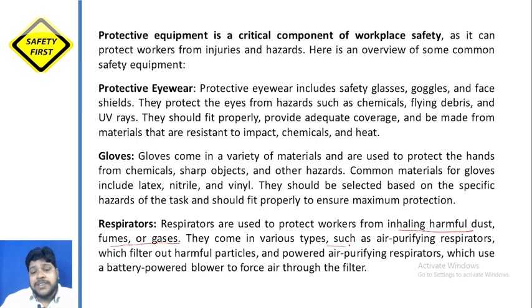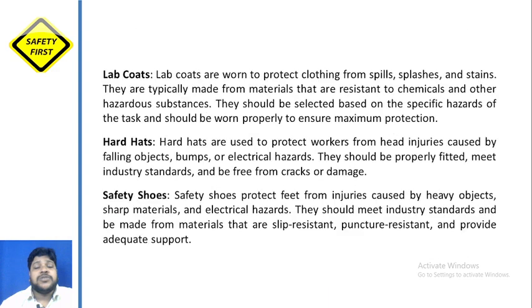कई सारे रेस्पिरेटर्स होते हैं. Air purifying respirators which filter out harmful particles, and powered air purifying respirators which use a battery powered blower to force air through the filter. तो ये सारा चीज होता है डिपेंडिंग अपॉन किस तरह के लैब में काम करें. हम लोग जनरल बात कर रहे हैं तो हम कोई लैब स्पेसिफिक इक्विपमेंट की बात नहीं, एक जनरल बातें कर रहे हैं. जहाँ भी कुछ हजार्ड्स हैं उसके लिए कुछ प्रॉपर सेफ्टी प्रोटोकॉल्स होते हैं और प्रॉपर इक्विपमेंट होते हैं जिनको हमको यूज करना होता है.